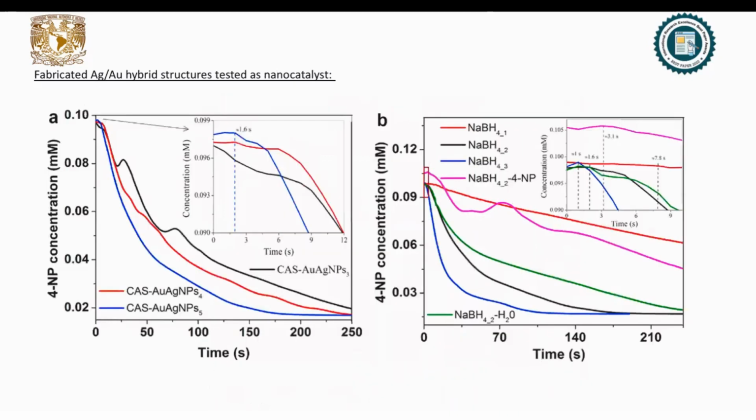Next, we did a small set of reactions using different concentrations of nanoparticles to check the induction time, which means the time it takes to start the reaction. We can see that within seconds. When you add the catalyst, within less than 2 seconds, less than 1.6 seconds, we can observe the immediate start of the reaction. That depends on how much catalyst you are using.